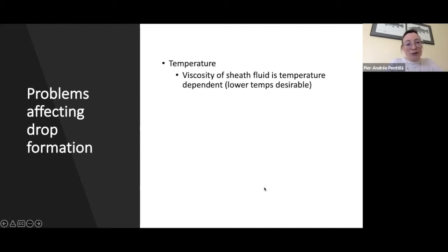If you've ever been in a cell sorting or flow cytometry facility, you will want to put on a sweater, as we're known to keep the temperatures quite low. And that is, of course, because higher temperatures will cause disruptions to the laminar flow, which is something we want to avoid when we're sorting cells.